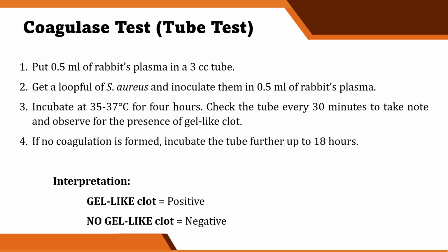Okay? So, una, 4 hours natin siya i-incubate, pero i-check natin siya every 30 minutes. Okay? So, bakit kailangan natin i-check every 30 minutes? For the presence of the gel-like clot. Okay? That is because of the tendency na mag-autolyze yung gel-like clot because of the presence of staphylokinase.